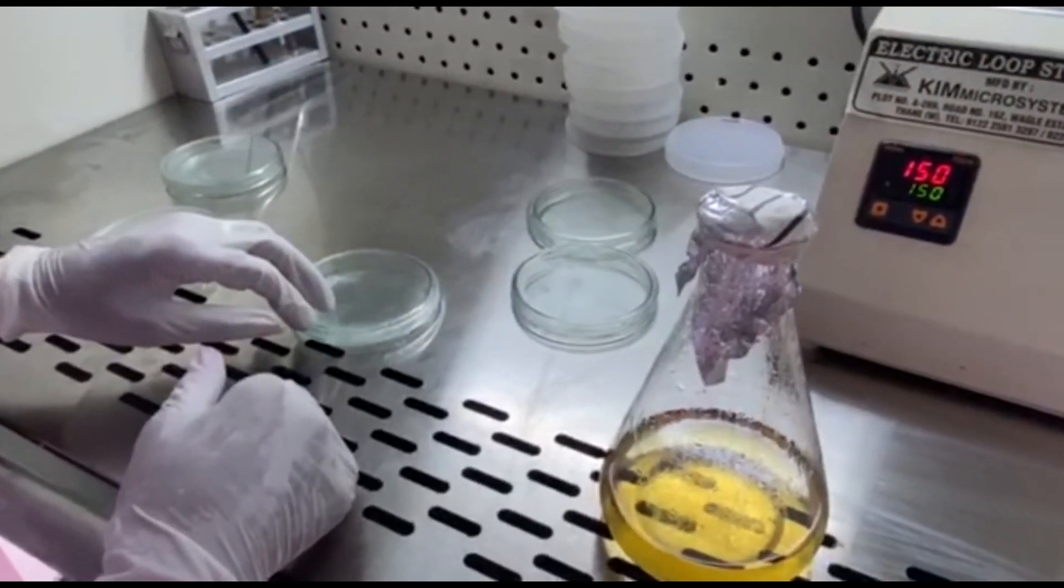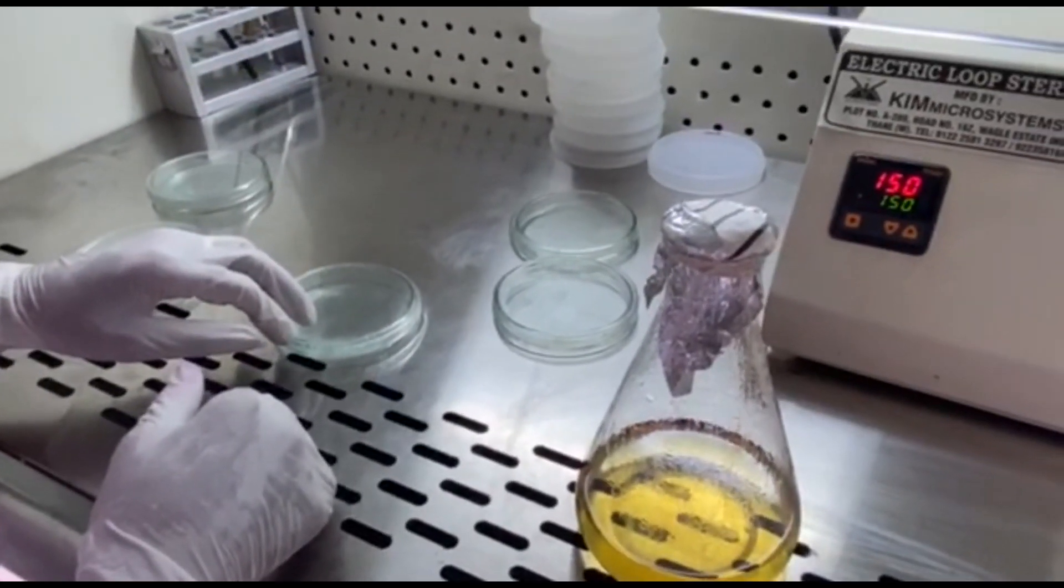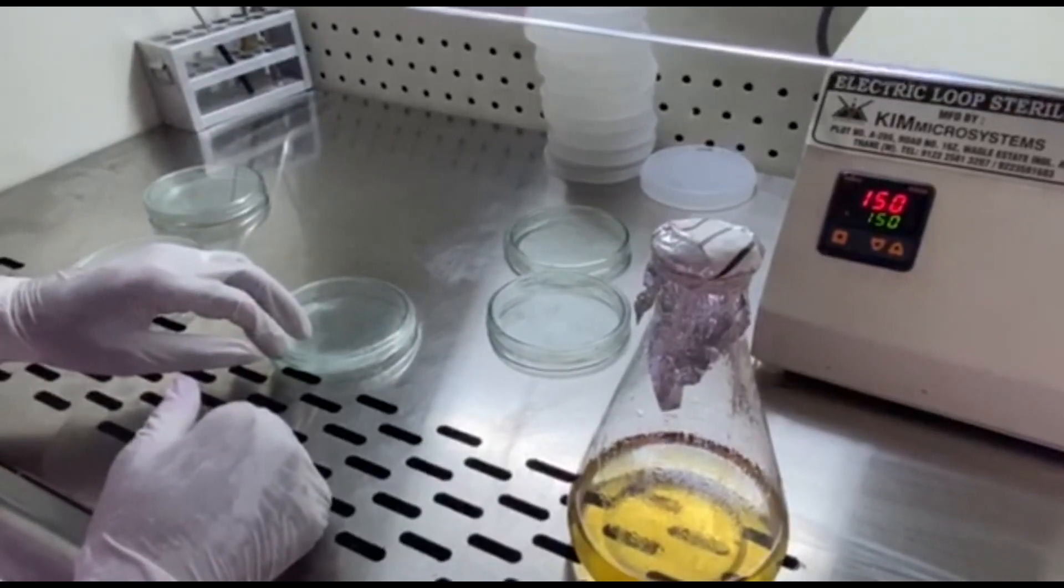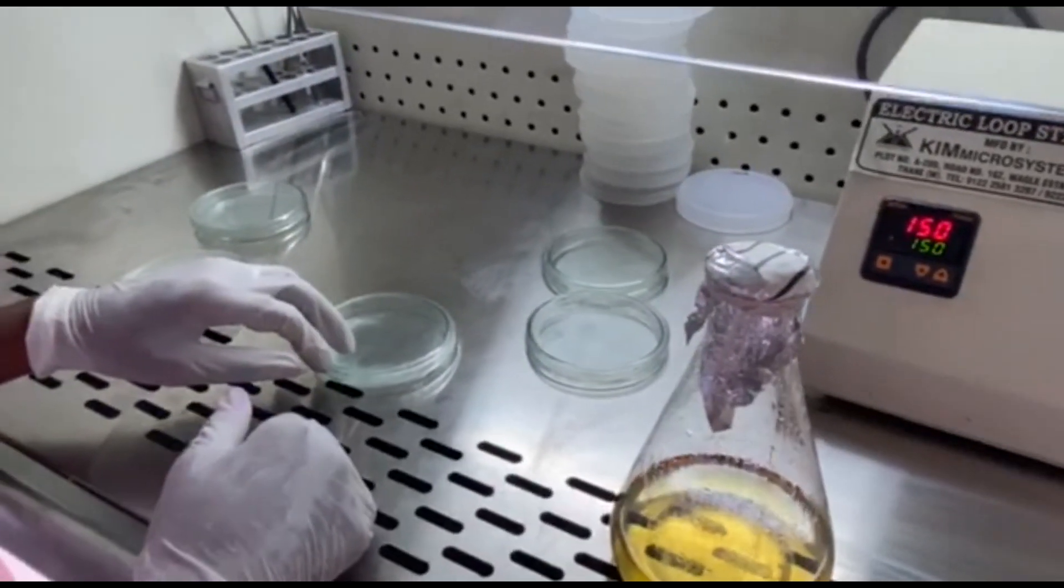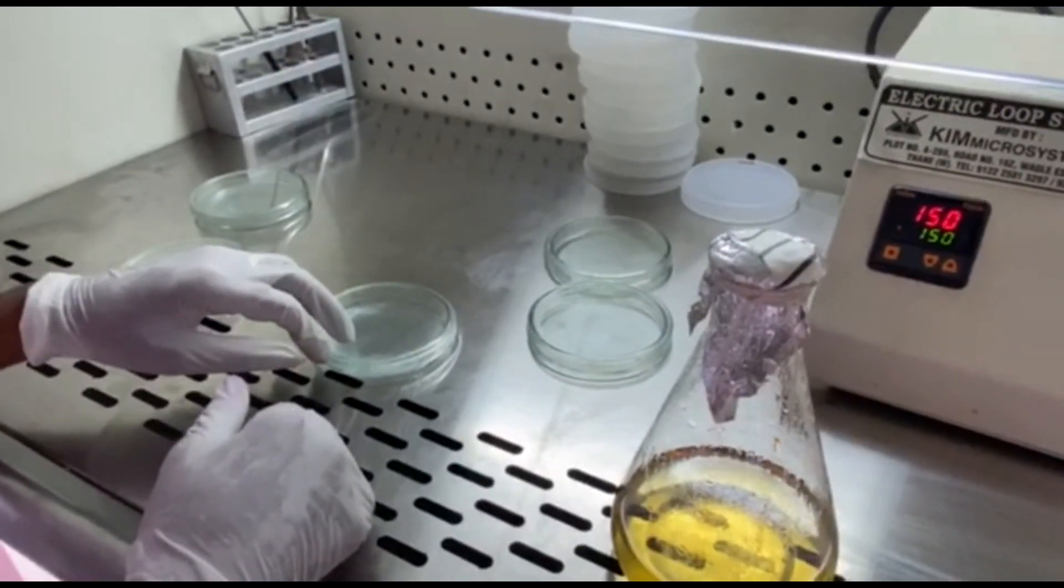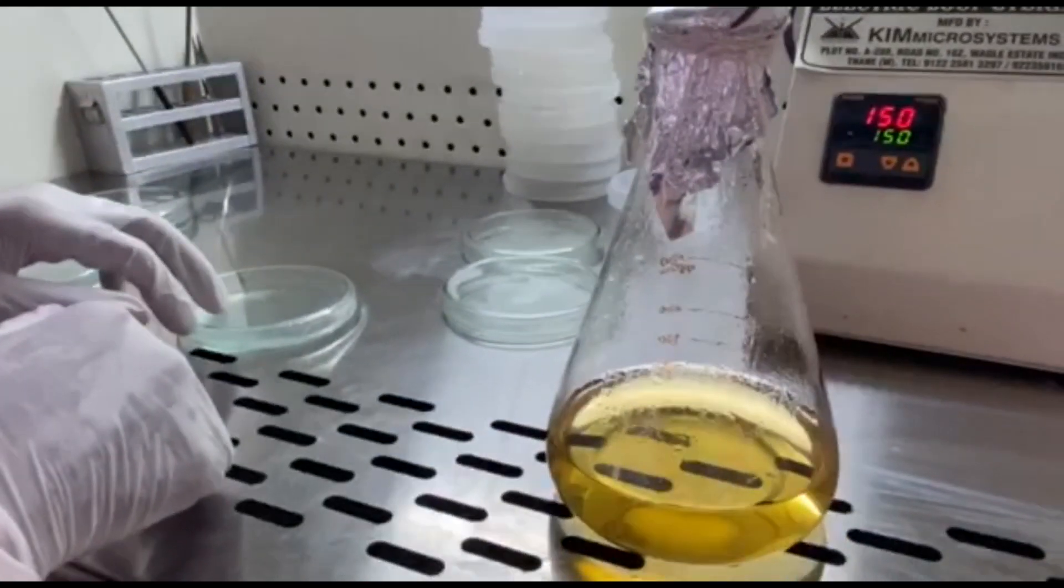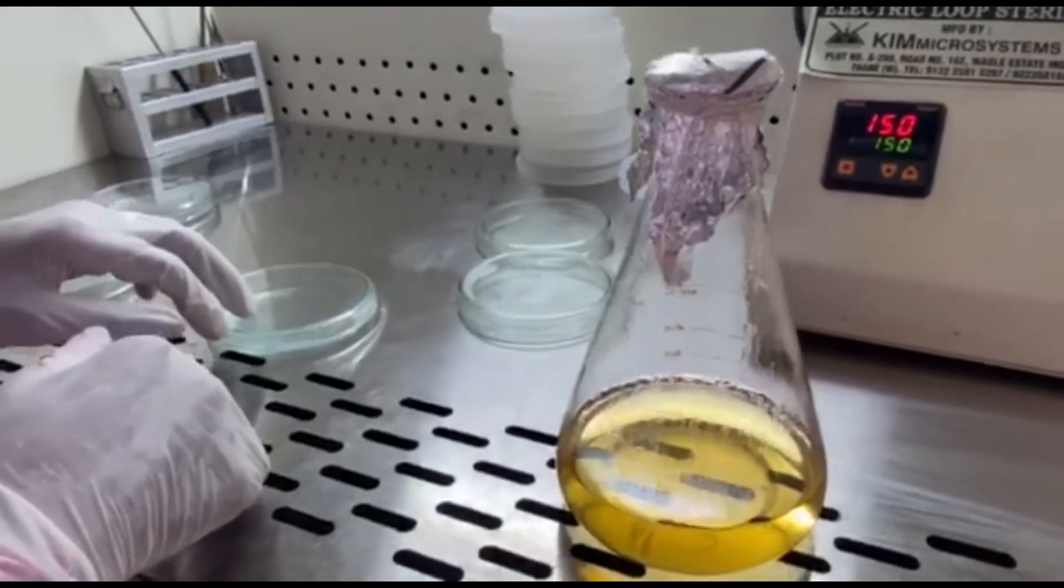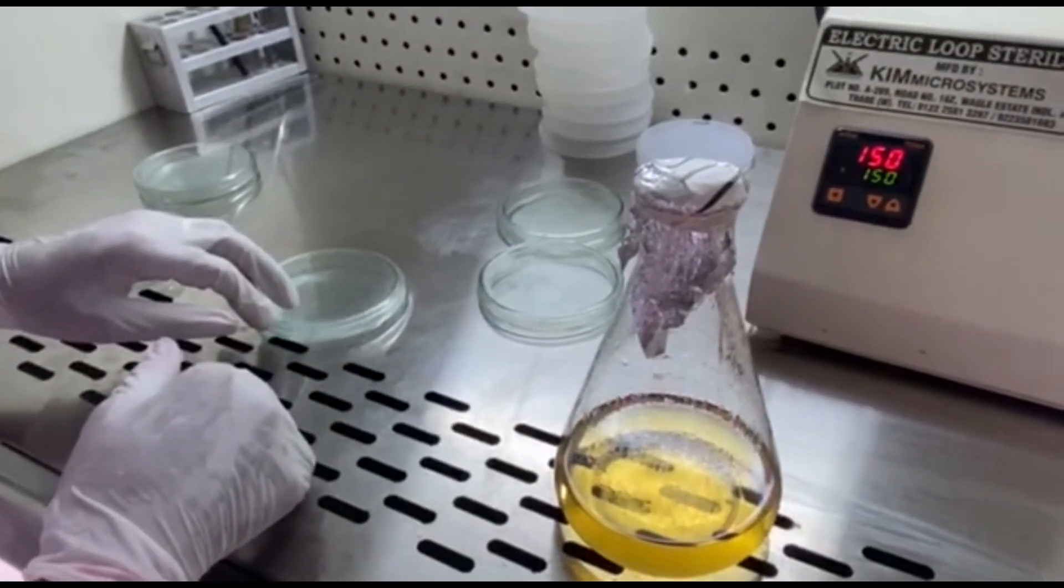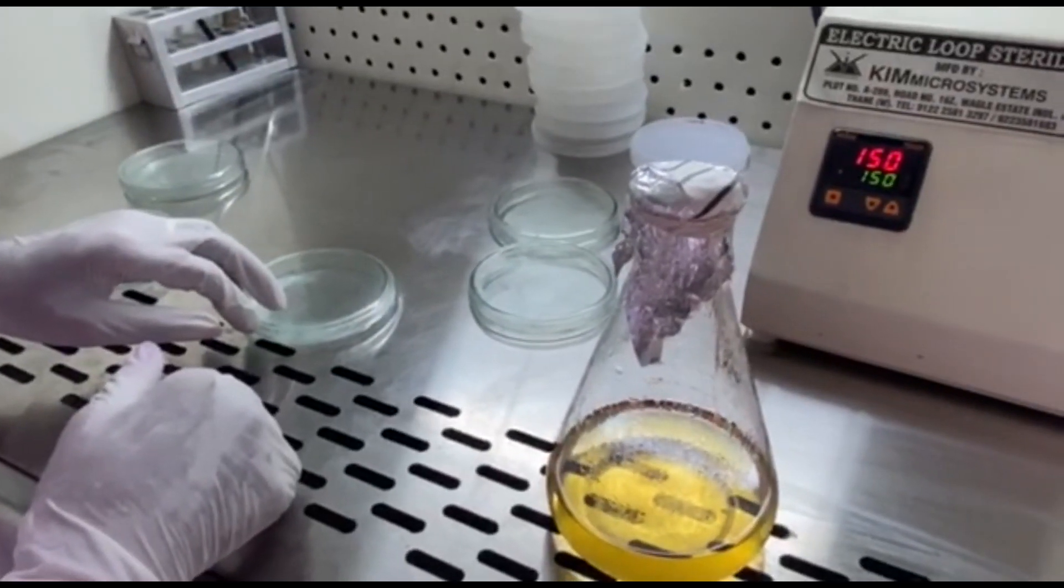Now going ahead with our preparation of blood agar, we have to prepare the base first. The base will be made 2 mm thickness. Why? Because 4 mm thickness is what a basic media height or depth should be. So now this is bilayer, so we will have 2 mm of nutrient agar base. Before going ahead, you need to check the temperature.